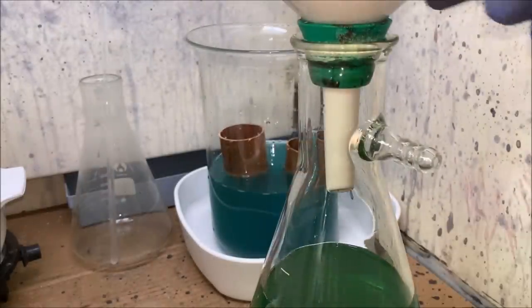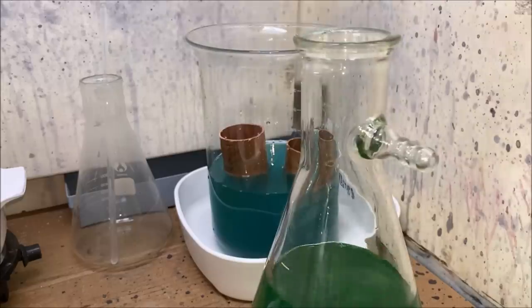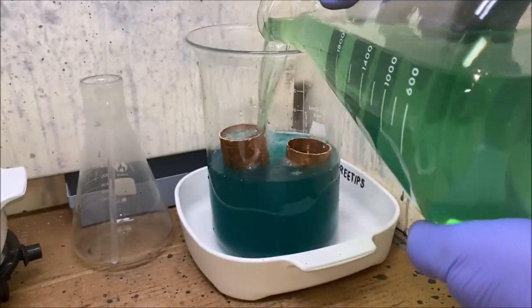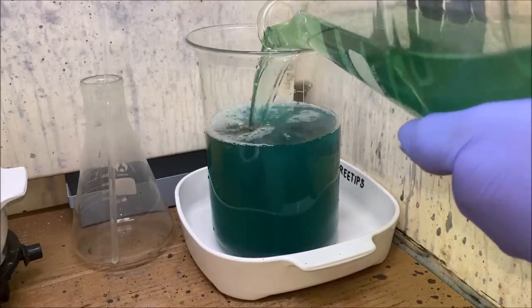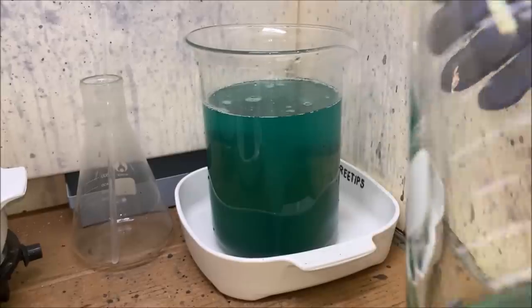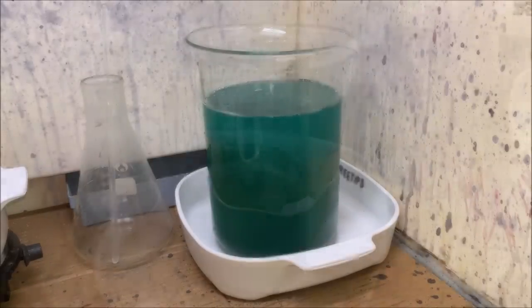I need some room in this flask so we can keep going with our piranha solution over here. So I'm gonna add some of this now to the beaker with the copper in it. And like I said, this is gonna have a lot of nitric acid in it. But what we'll try to do here is just recover any metals that the solution may contain, mostly silver, not very much, but enough to go ahead and sacrifice some copper and get the silver. All right, here we go.